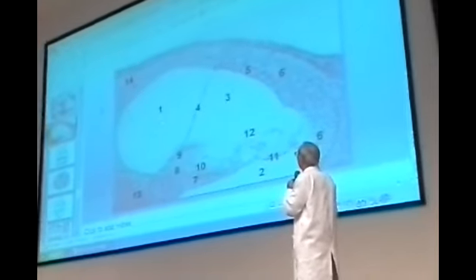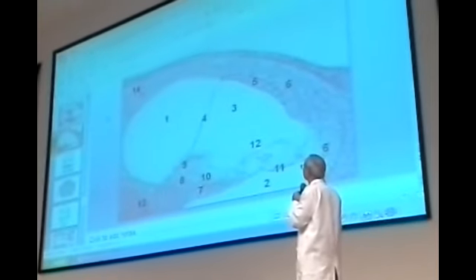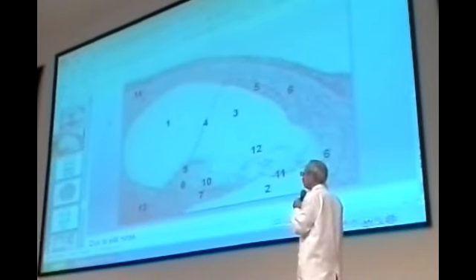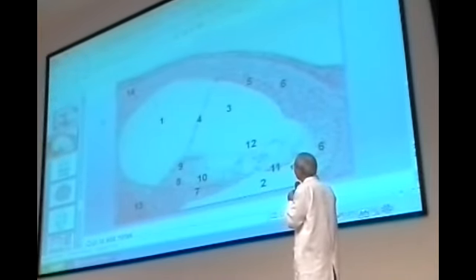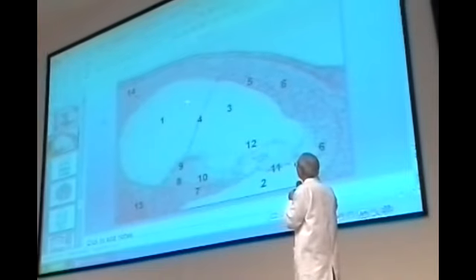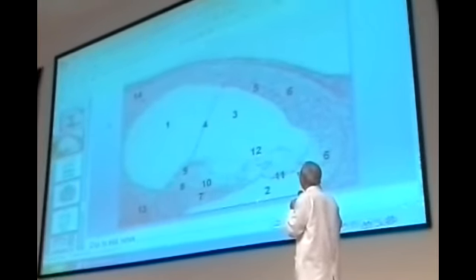Perilymph. Where is its opening down to the vestibule? It is connected down with the vestibule. What connects it up with the scala tympani?